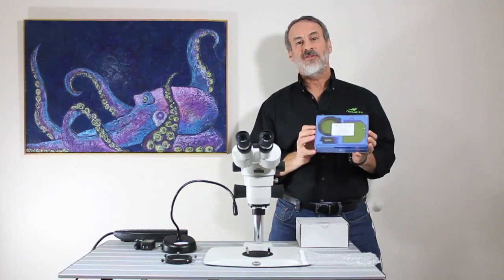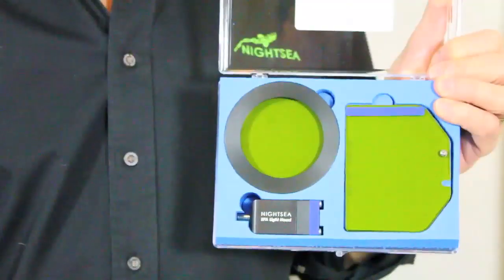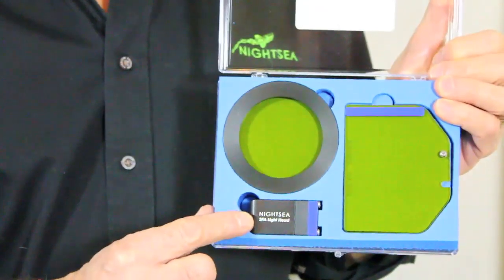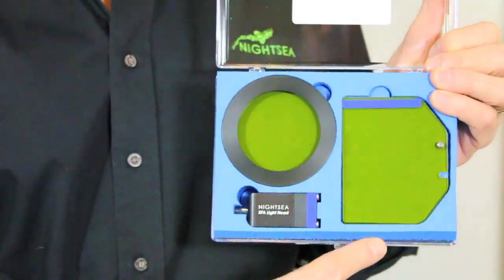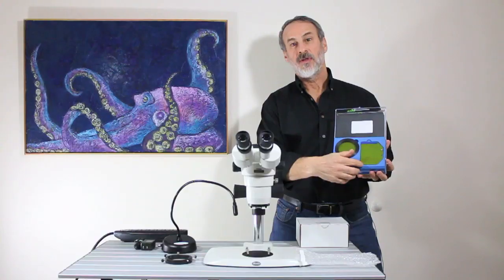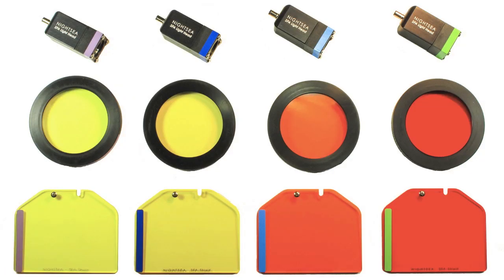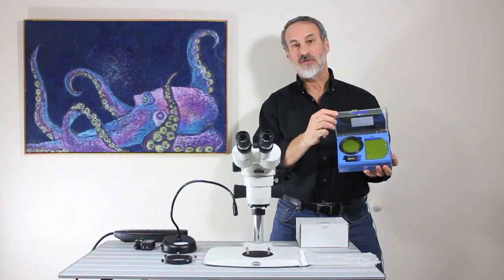And what we call the light and filter set. This consists of a high intensity LED light head module, a matched barrier filter, and a filter shield made out of the same material. We have different wavelength combinations for work with different fluorescent colors.